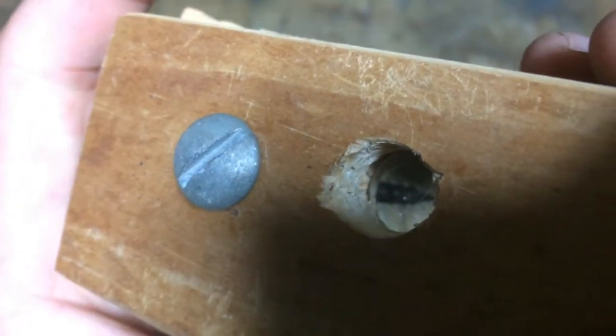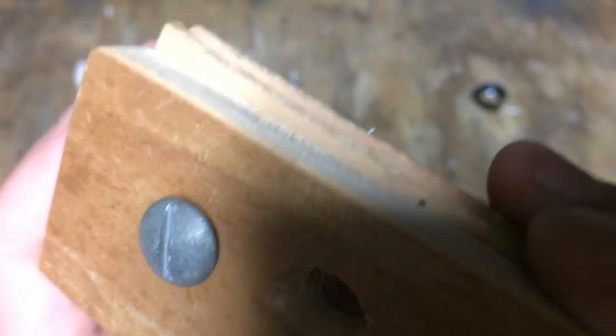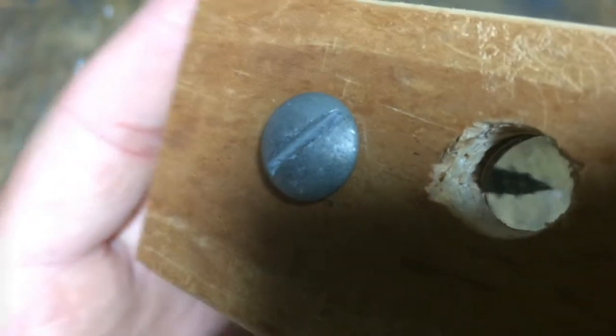It's a bit hard to get the camera to focus on that, but you can see the actual size of it is about that big. When I bring it up, it magnifies it — not by very much. So here it is. Here's the view of the little screw that I'm moving right now through the microscope. You can see it magnifies it pretty well for just using one lens.